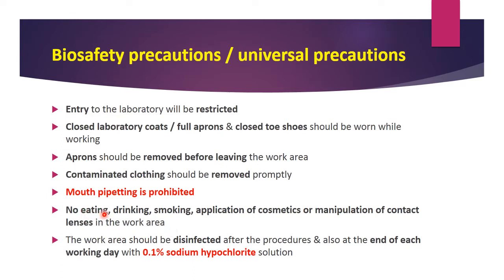So you should not eat, drink or smoke in the laboratory, and also we should not apply any cosmetics, because cosmetics are also made up of chemicals, and when you are handling other chemicals you may get some cross reactions. So avoid usage of cosmetics. Manipulation of the contact lenses means you should neither wear nor remove your contact lenses in the laboratory premises.